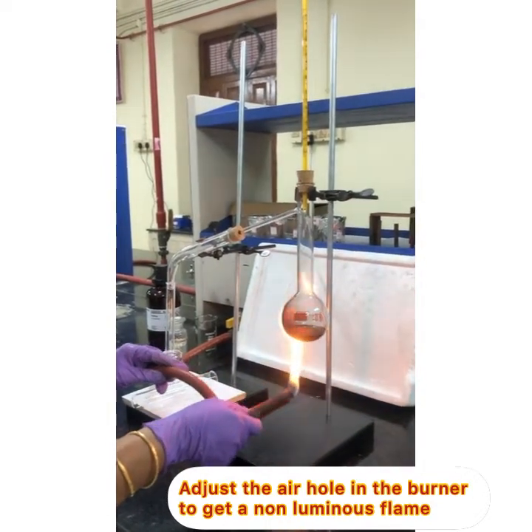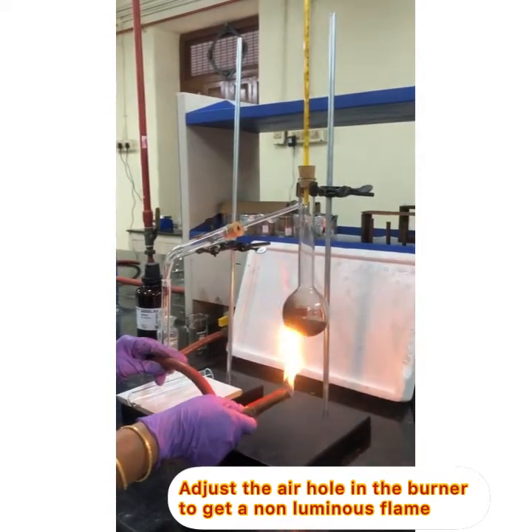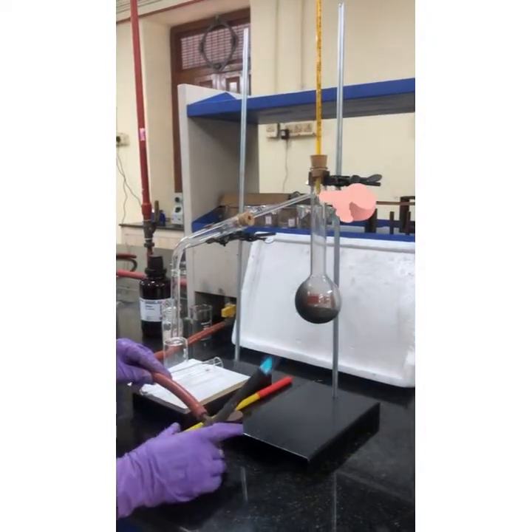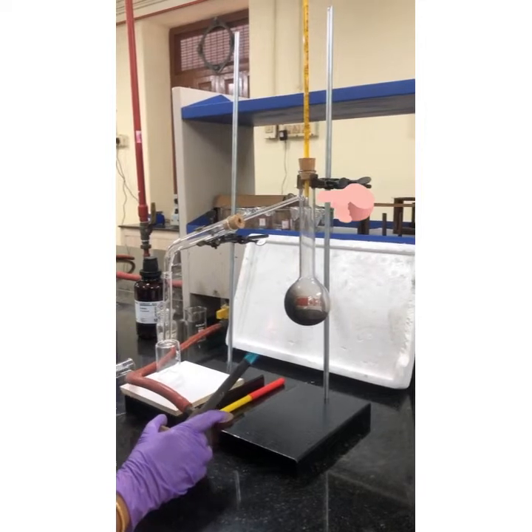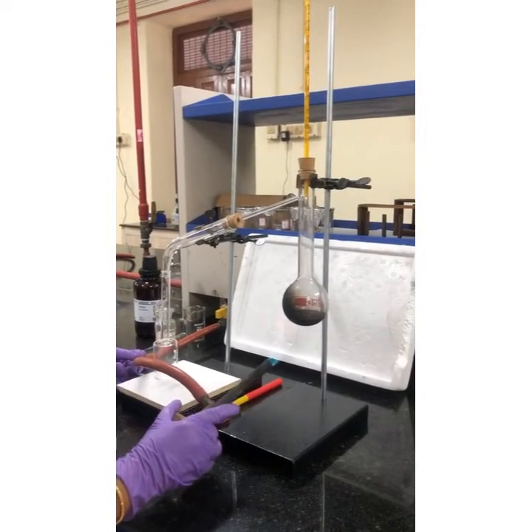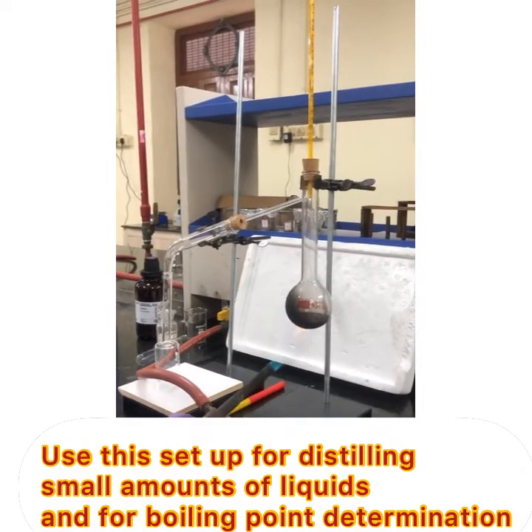The important aspects to remember: take only small amounts of liquid, a boiling chip has to be added, and the thermometer has to be fixed in such a way that the bulb of the thermometer is at the mouth of the side tube. Wear a mask or eye protection when you do this distillation.